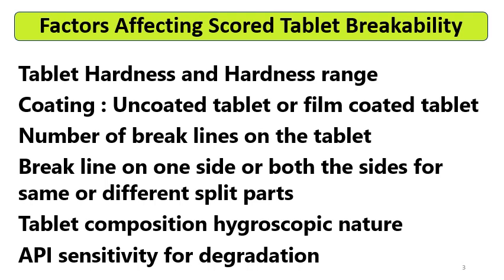Then coating. The IR formulation or extended release formulation or MUPS formulation may have the coating. The coating will be film coating generally, as the functional coating tablets are not scored. So whether the tablet is coated or uncoated, that will impact onto the tablet breakability.